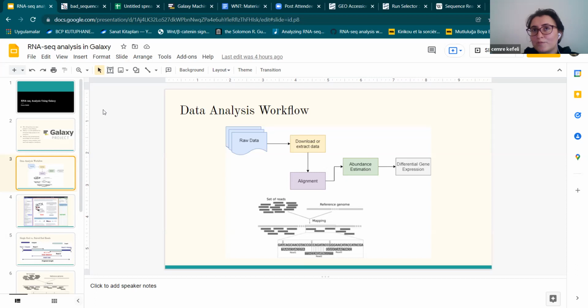Because we have to use the genes in machine learning. We needed the genes to annotate them. I mean, we can say that a transcript is a target, or we have to say the gene is a target.